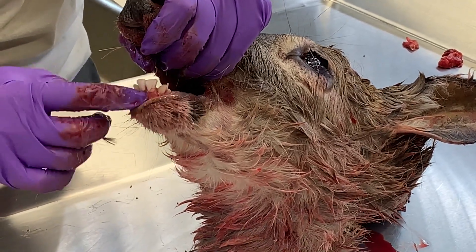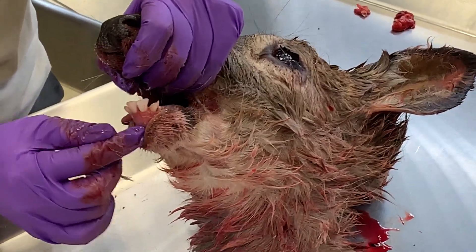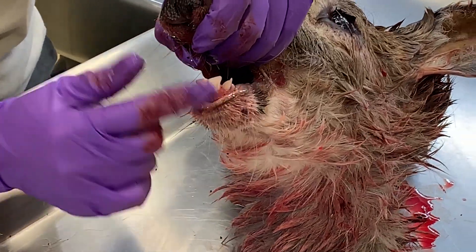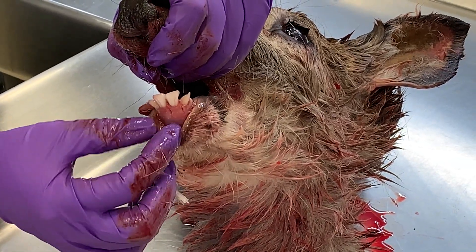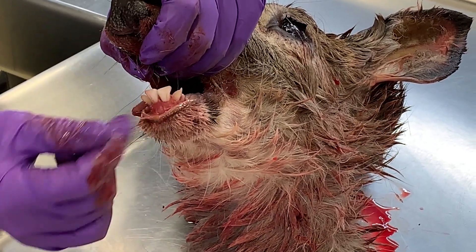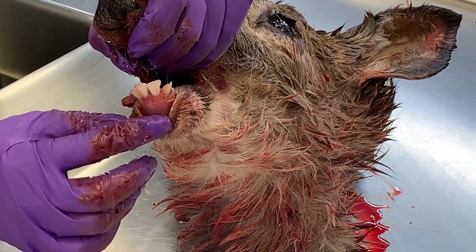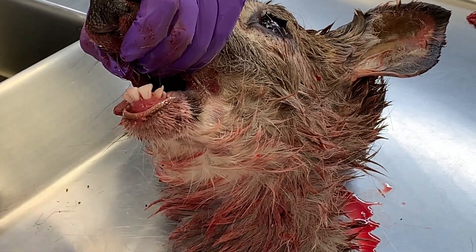The most important part here is that we get this root as one piece. The nice part is they only need one tooth. It's best to extract both in case the tooth breaks during the analysis process, but if you can only collect one, that's okay. If you happen to break one, you always have another one you can submit.